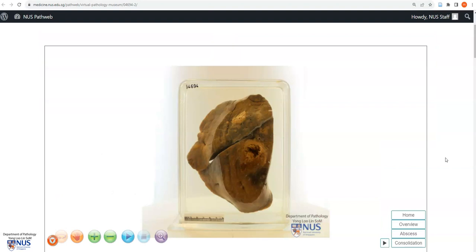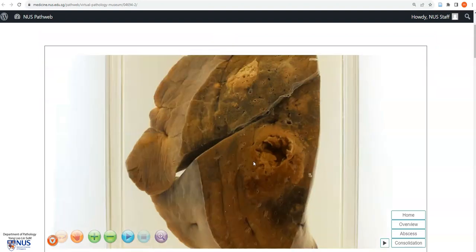In summary, this is an example of an abscess of the lung. What we can see is an irregular cavity containing yellowish purulent material, and this is usually due to bacterial infection. Thank you.